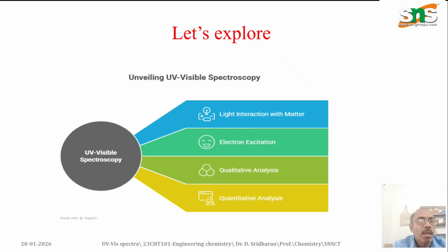It is used in many places, like biomedical and industrial applications, in production industries, for organic synthesis, and for checking products against a specific material, investigated using UV visible spectroscopy.